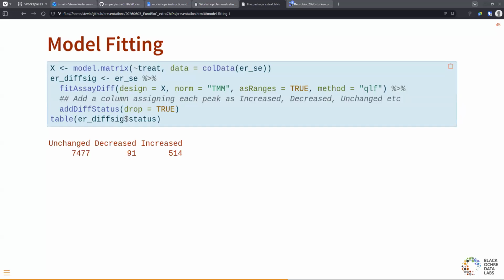Anyone here come across smooth quantile normalization? Another one of Stephanie Hicks's packages. Sorry, Dan over here. Yeah, that does quantile normalization, but in a treatment group specific manner. And so you can normalize across groups, and there's a weighting method that they've developed where you can normalize this region of signal as being from the same distribution across samples, but then you can separate that signal out and normalize within treatment groups. It's pretty slick. Yeah, smooth quantile normalization. I like that with sliding windows.